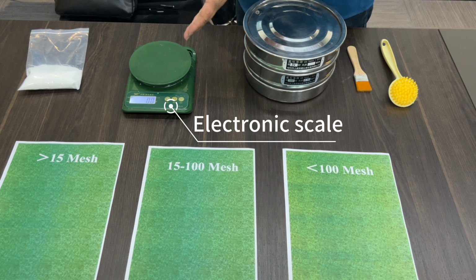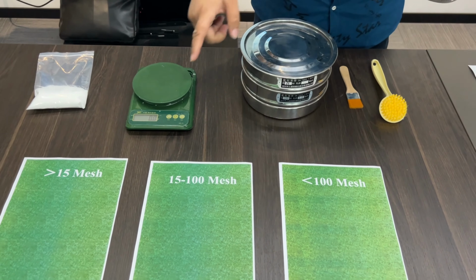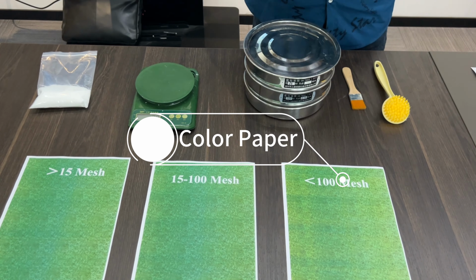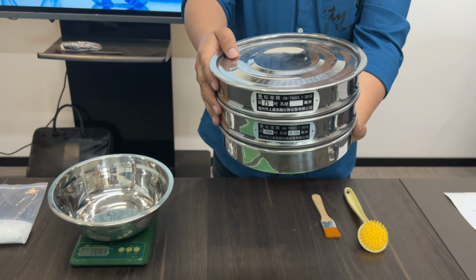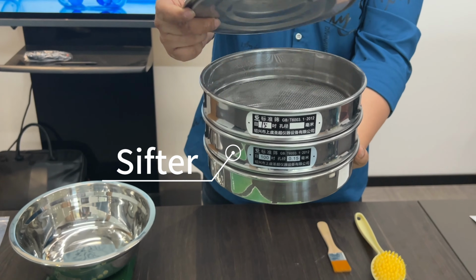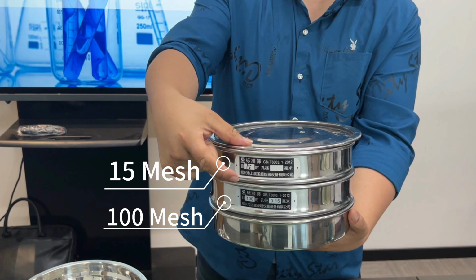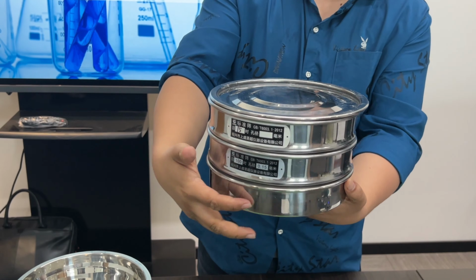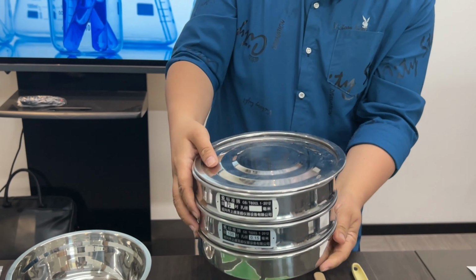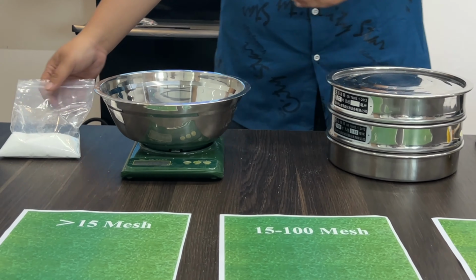Electronic scale, the bowl, color paper, sifter. It has the cover, the 15 mesh sifter, 100 mesh sifter, two brushes. Let's start.